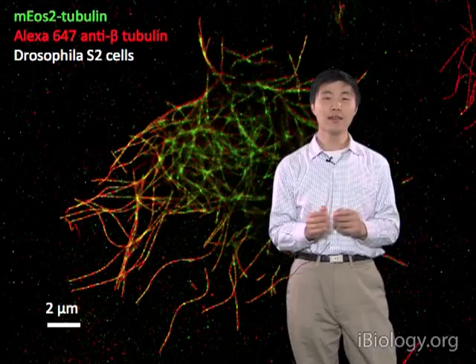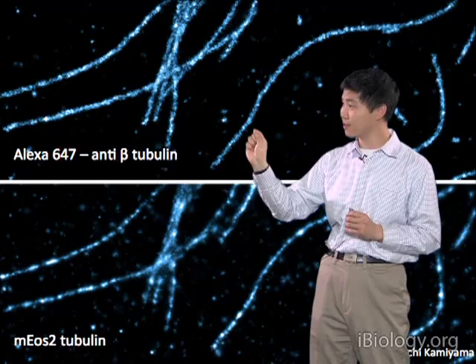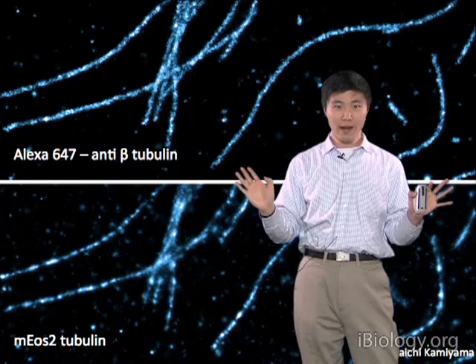And here we can compare the same structure imaged with two different probes, which I'm going to discuss in more detail several slides later. So this is one way of doing multicolor imaging.